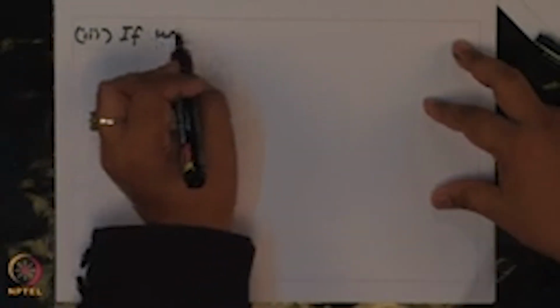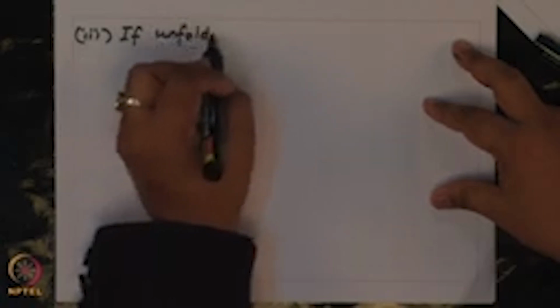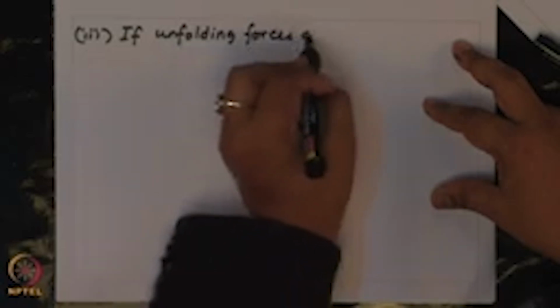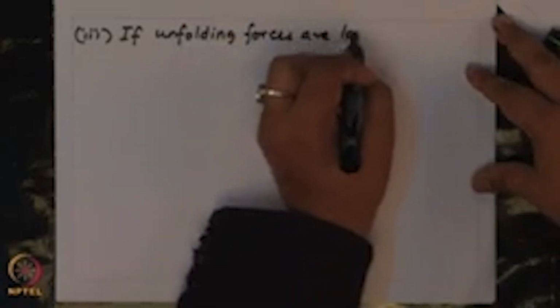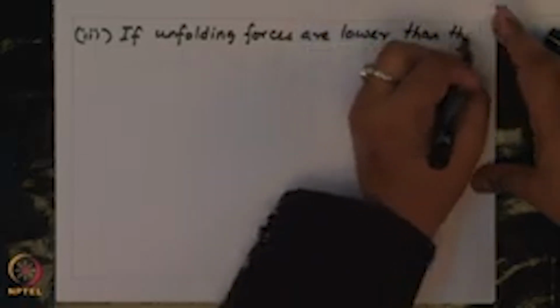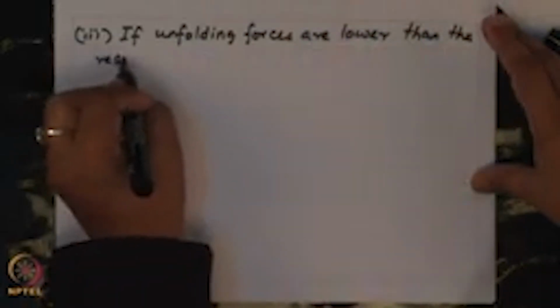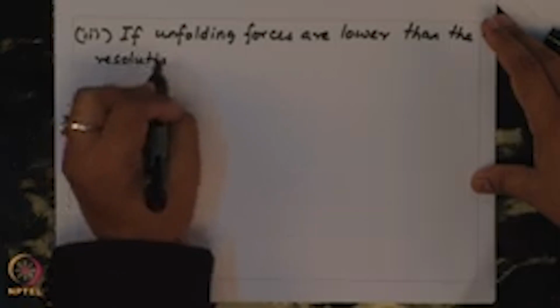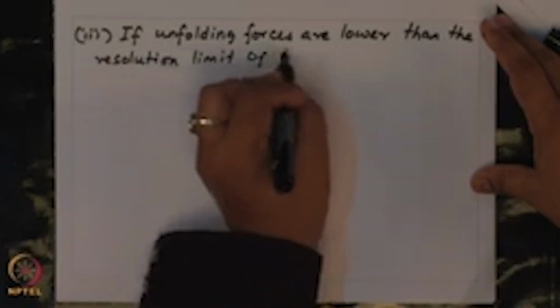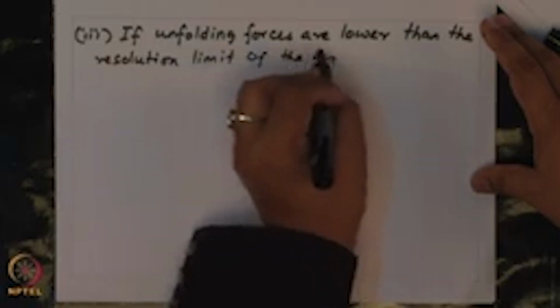If the unfolding forces are lower than the resolution limit of the instrument.